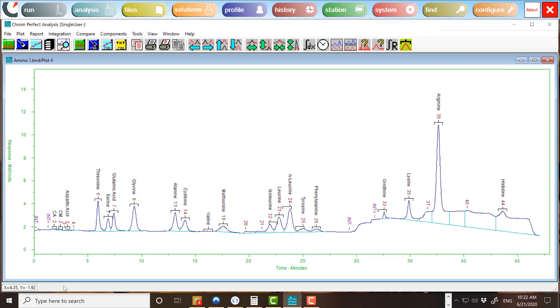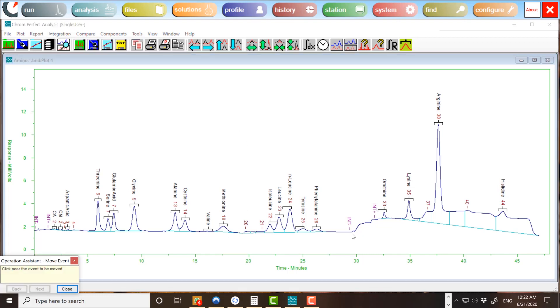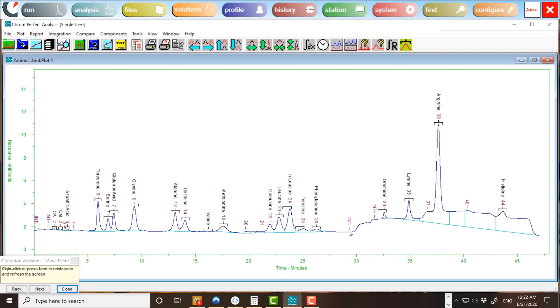To move a timed event, choose Integration and Move Event. Click on the chromatogram plot and the nearest event will be selected. Drag the cursor to where the event should be located. To confirm the action, right-click on the chromatogram plot. The chromatogram will be reintegrated and the event labels will move to the new location.